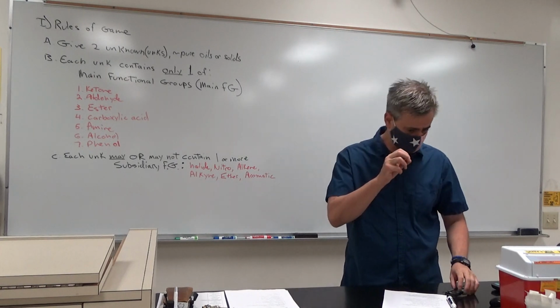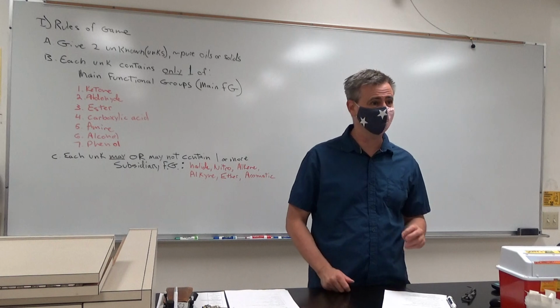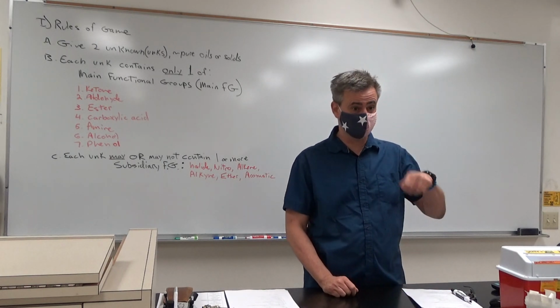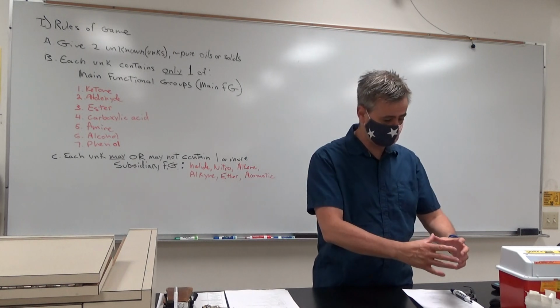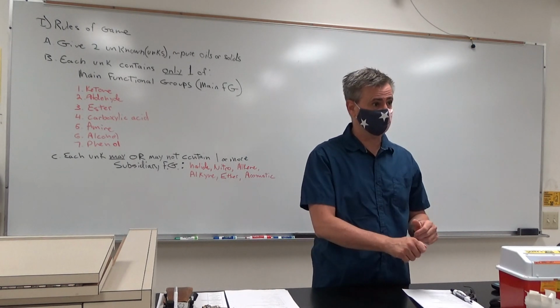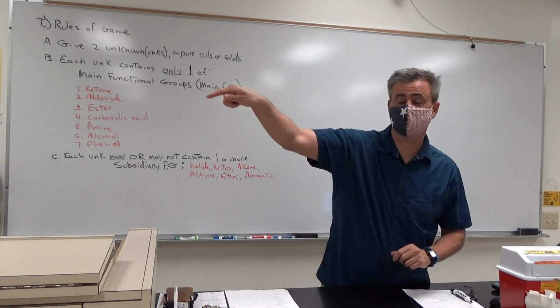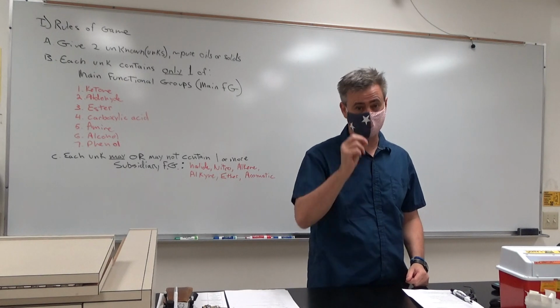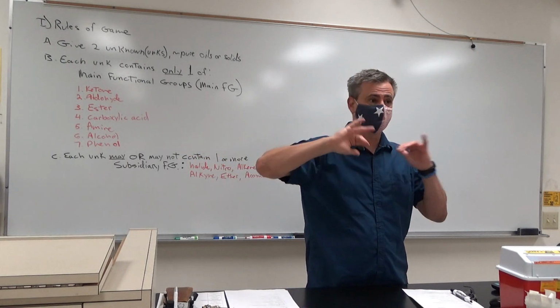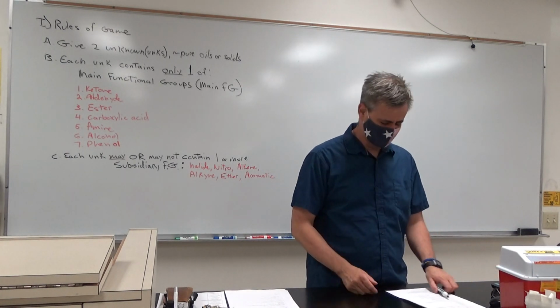The other thing is pipettes. If you put a pipette or a spatula into your unknown, I'd like you to keep a beaker by your desk and grab the ethanol that's right in front of you and give the pipette a little squirt before it goes in there. We've had people put a pipette into a really stinky one, and then the room is ruined for a long time, and other professors get very mad at me.